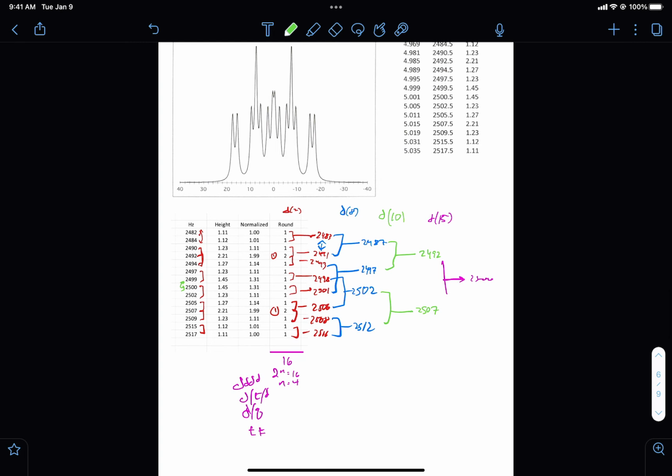If you can solve multiplets like this, if you could go back and do this on your own, looking out for the things that we learned to look out for, then I think you can probably disentangle any multiplet because it's so systematic. You just do one step at a time. You look for your first splitting, you unsplit all of those. You look for what's next, you unsplit all of those. You look for what's next, you unsplit all of those, and you keep going until you get back to one peak.